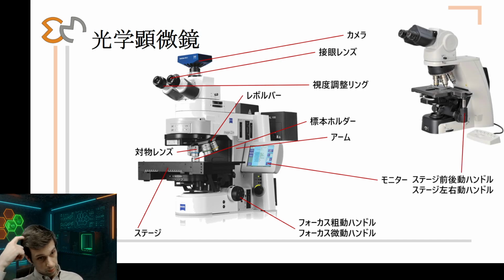And in the past, well, not so far in the past, the stages could be moved by using 2 dials. Nowadays, many stages are electronic, so you can control them by your mouse and your PC. And then you can regulate the light intensity and other optical parameters nowadays by electronics, in the past by using filters and additional lenses, etc.